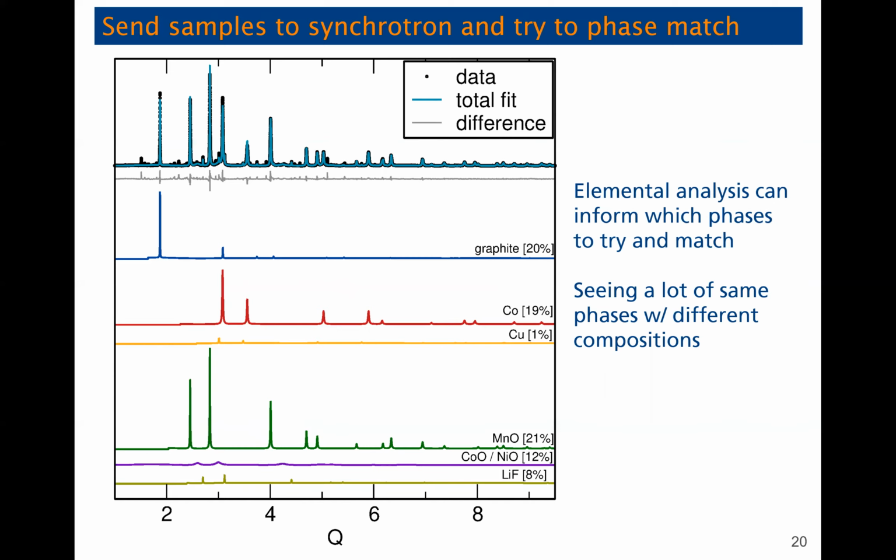Knowing that it's here means that they can find a way to get it out of the powder. And then one thing I'm trying to see is, do we actually have lithium fluoride in here? This is a salt that might have formed. The fluorine might have come from the polymer binder, or also the salt that's used in the electrolyte. But this is interesting to know. It's not in metallic form. Maybe we have some salt.